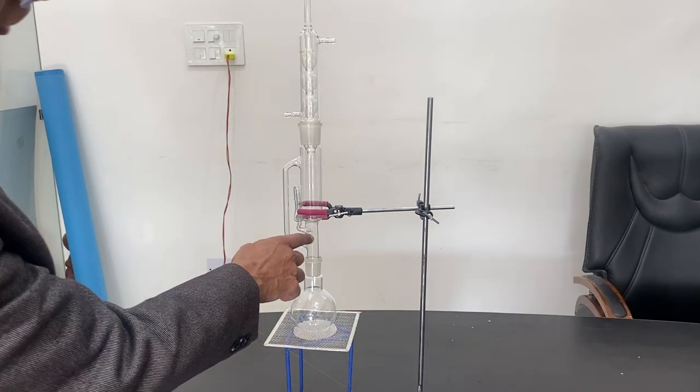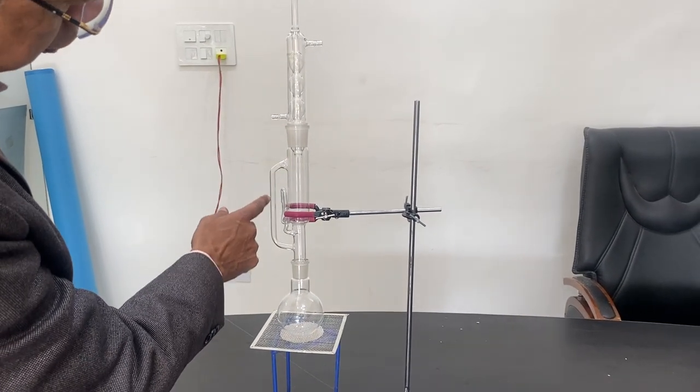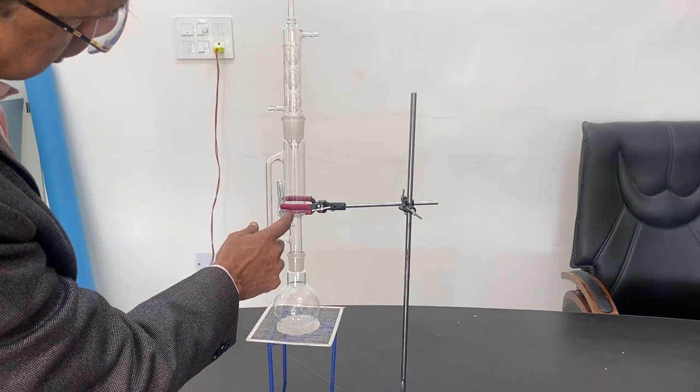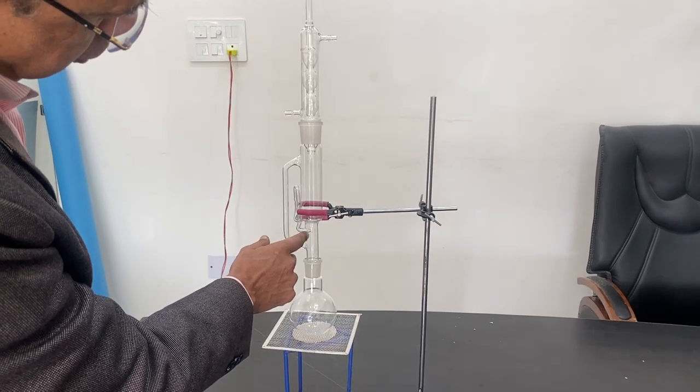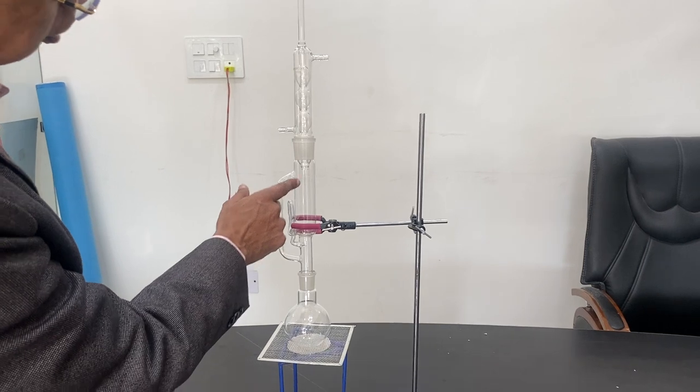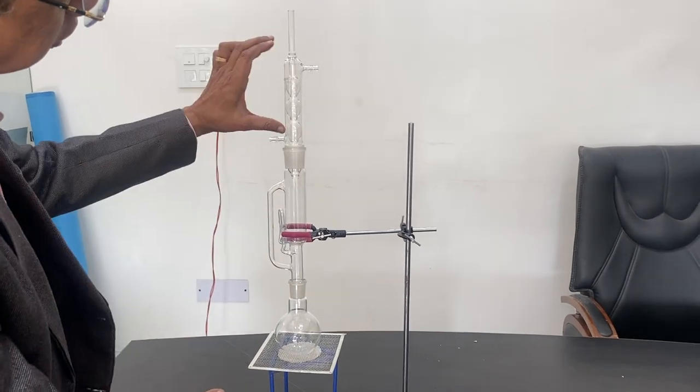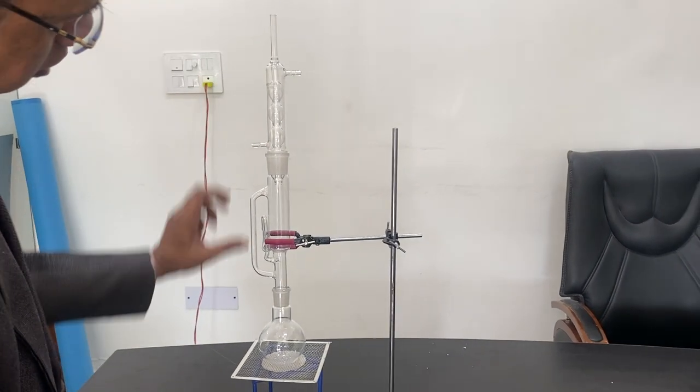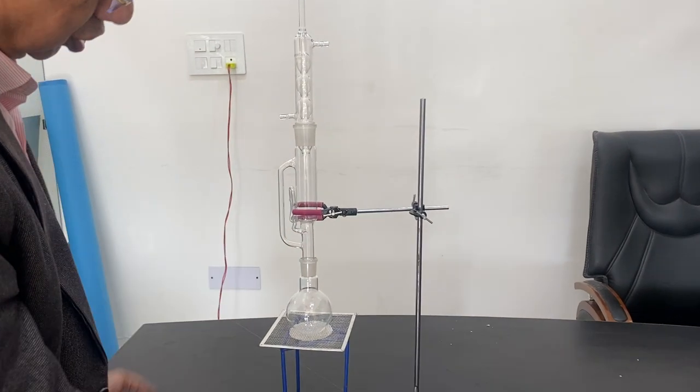This has tubes which pass back to this section, from the center, and pass to this section. So there are two tubes - the condenser part, Allihn condenser, bulb type, and round bottom flask.